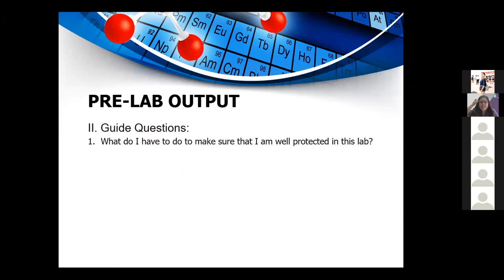Those are the procedures for operating the Bunsen burner. For question one — what do I have to do to make sure I am well protected in this lab — you need to wear protective equipment: a lab gown, mask when heating chemicals with fumes, safety goggles especially during lighting of the Bunsen burner, and gloves when dealing with chemicals. The ideal lab gown uses snaps rather than buttons so it can be quickly removed in case of emergency.